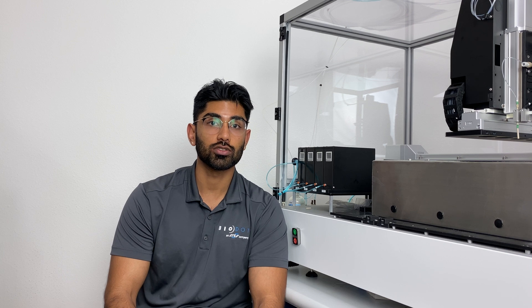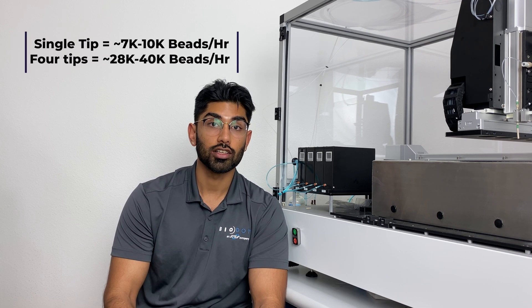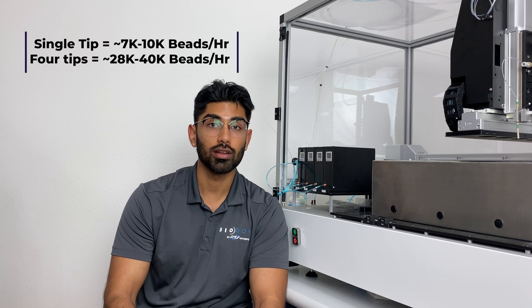Each of our dispensers allows for up to 10,000 beads per hour, so with the four dispensers that we can implement, that's 40,000 beads per hour which can be achieved.